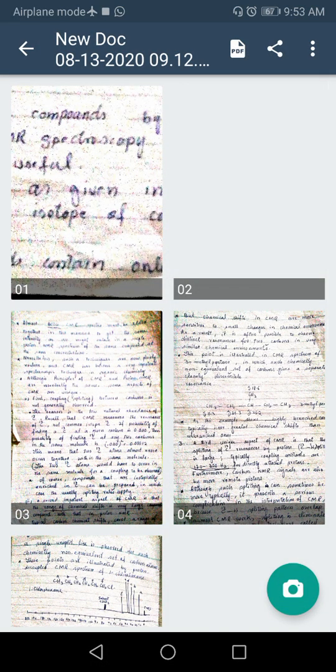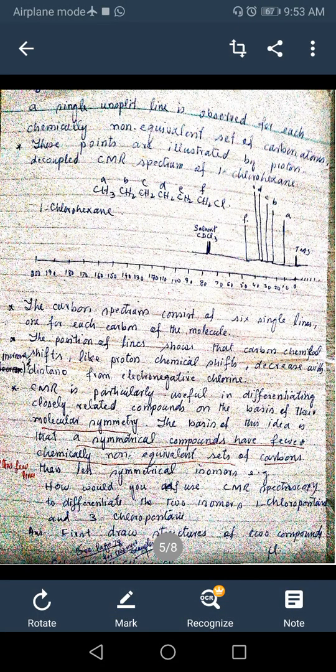Usually C13 and proton can interact and will lead to the splitting of the peaks, and the distance between the peaks will be 120 to 200 Hz, which will lead to the overlapping of many signals. And secondly, when the splitting of the signal is observed, then the intensity and height of the peak is further decreased. So to overcome this problem, proton decoupled C13 spectra is used.